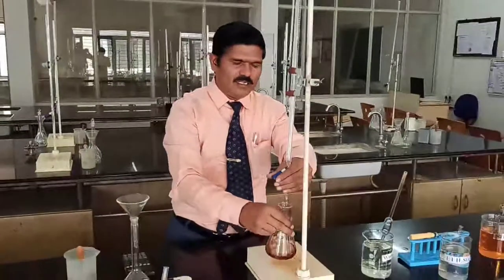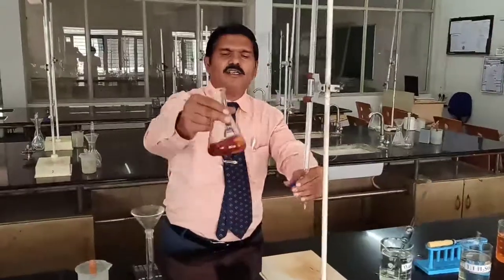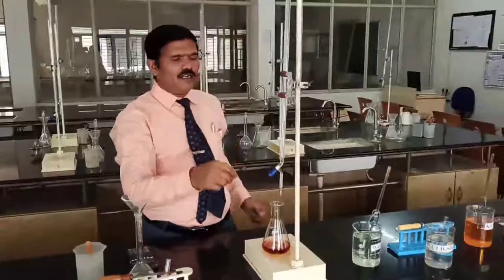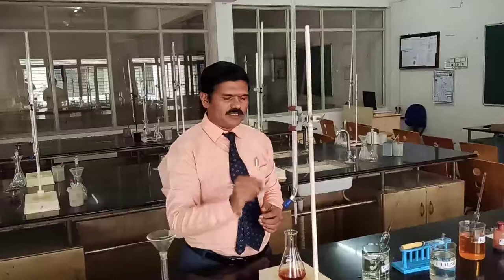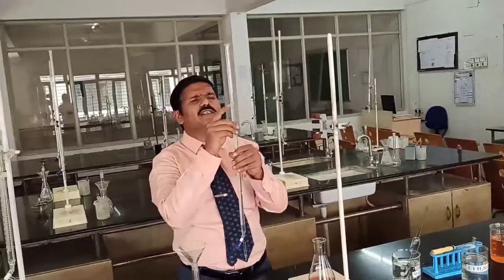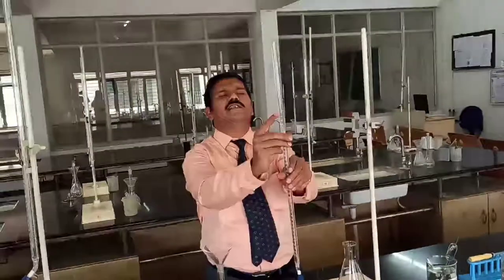I can add another one drop. This is the complete, stable reddish brown color. This is the end point. Immediately record how much ferrous ammonium sulfate solution is consumed to neutralize this potassium dichromate. Now read the burette — the burette reading is 11.6.